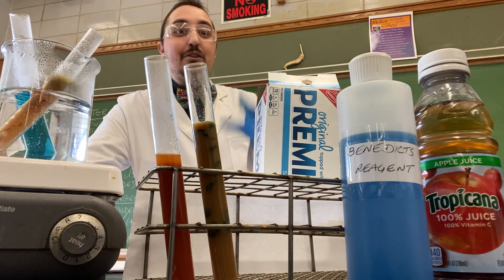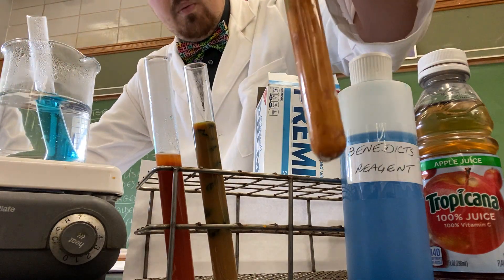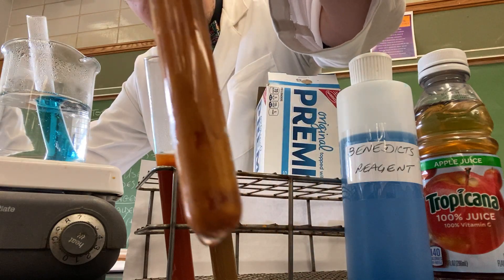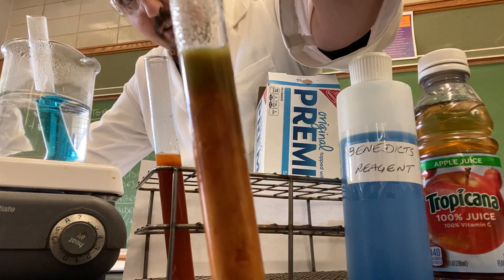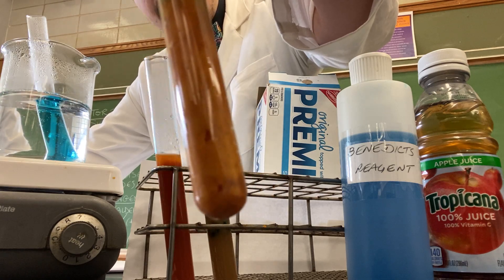We also threw in some crackers and Benedict solution with water during the break. You will notice that it has a greenish color on the top and an orangish color towards the bottom.